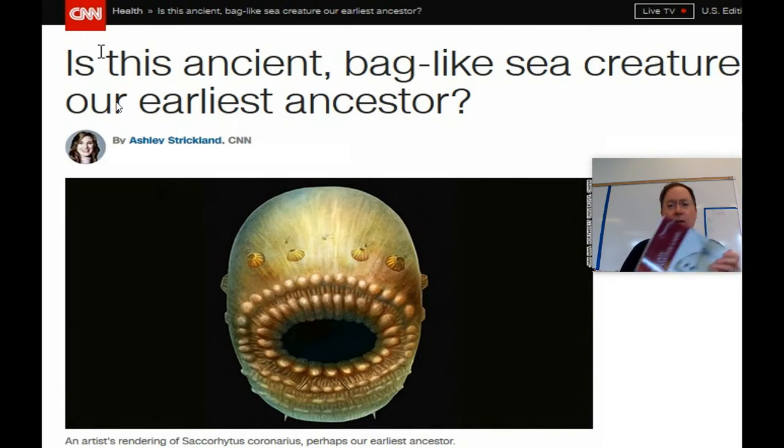It is one of our 13 labs that we have to do in the AP Biology Investigative Labs Manual, and certainly you might see it on the AP Biology test.